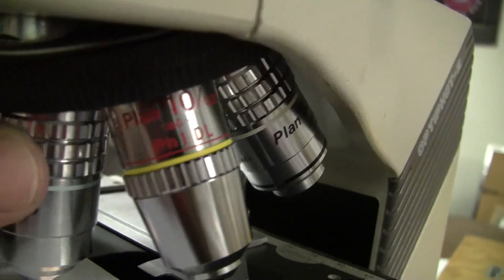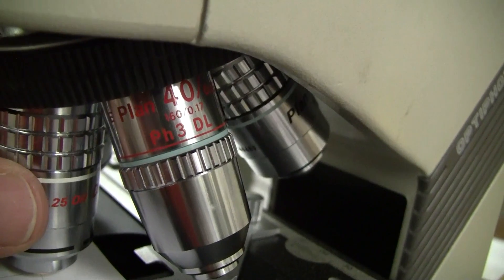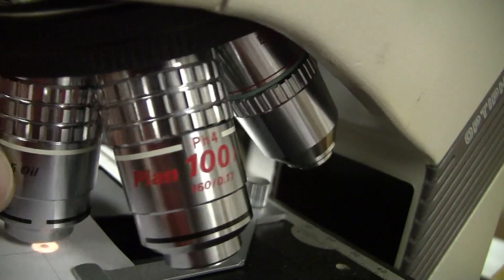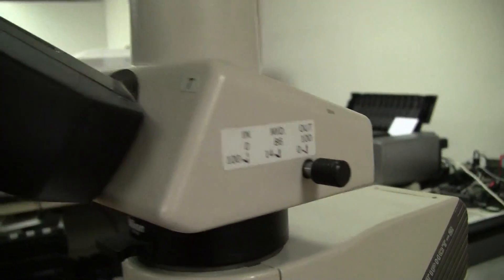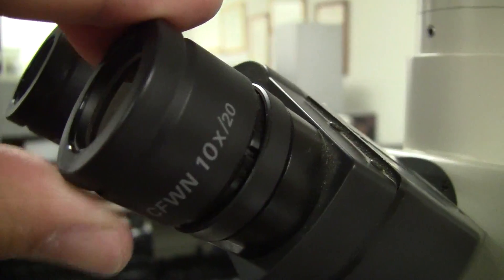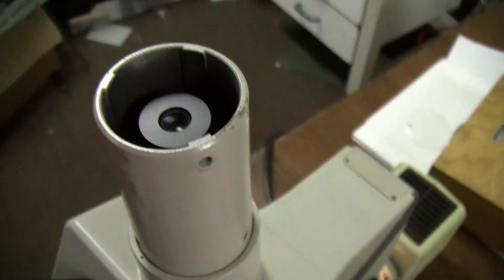Walking through the objectives. The eyepieces. The top mount.